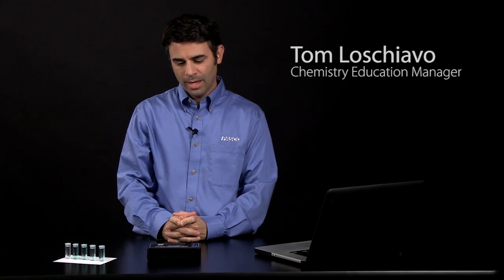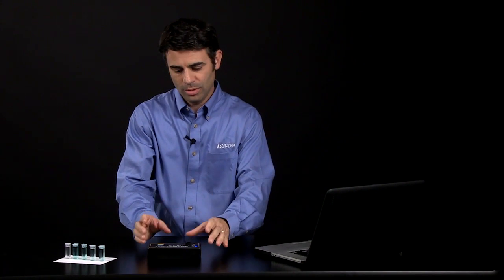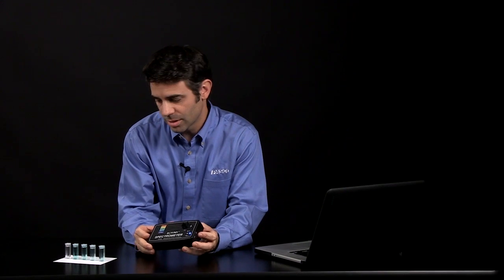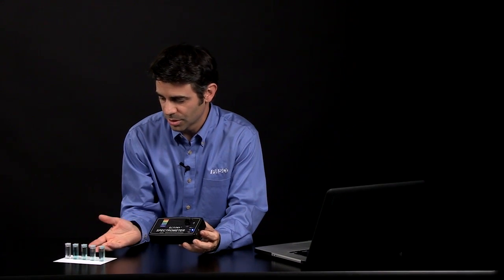Hi, this is Tom Loschiavo, Chemistry Education Manager at PASCO Scientific, and I am here today to talk about how you can use the PASCO spectrometer to do Beer's Law analysis of solutions.